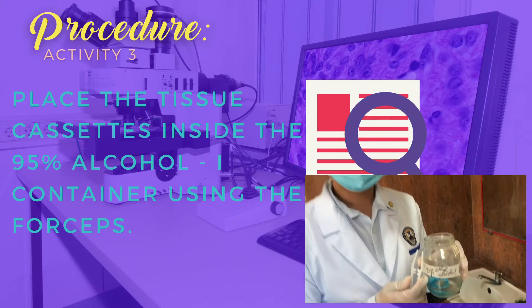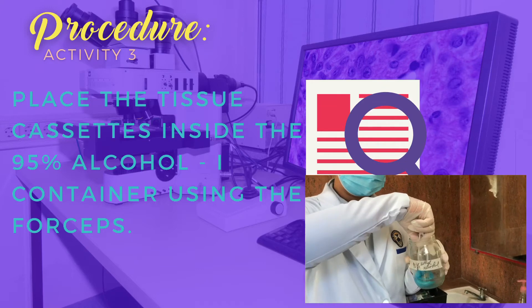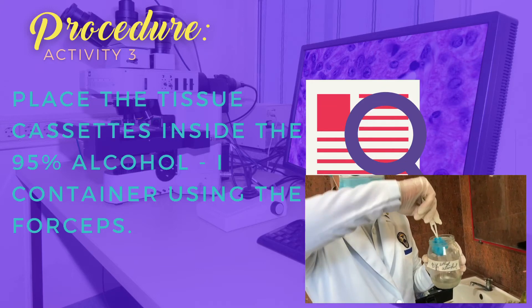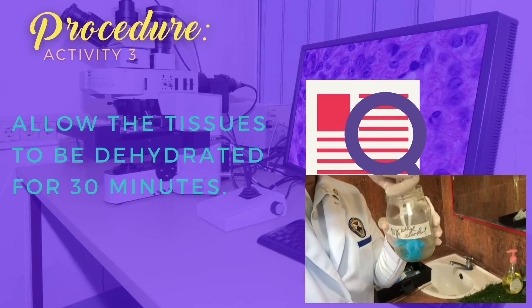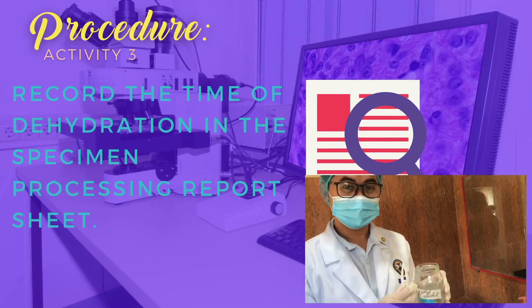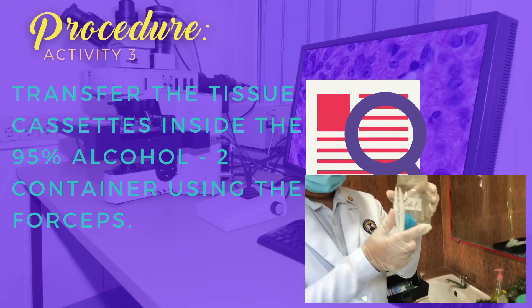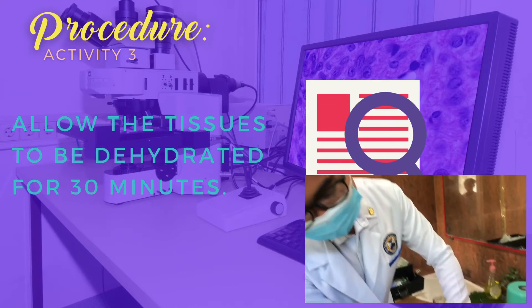Place the tissue cassettes inside the 95% alcohol container 1 using the forceps. After that, proceed to recapping the container to prevent evaporation. Allow the tissue to be dehydrated for 30 minutes. Don't forget to record the time. Transfer the tissue cassette inside the 95% alcohol container 2 and re-cap the container.